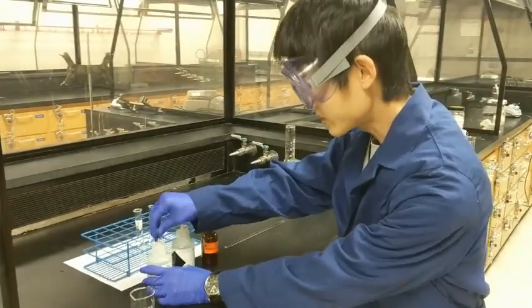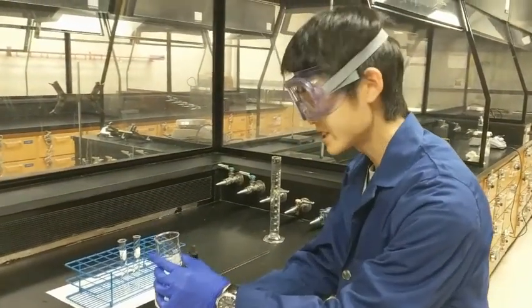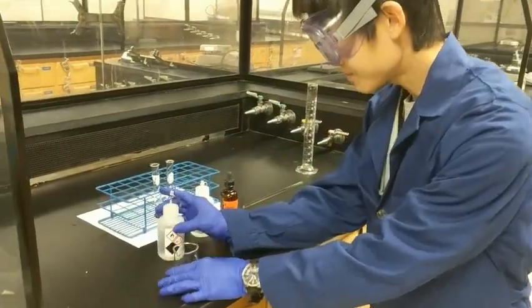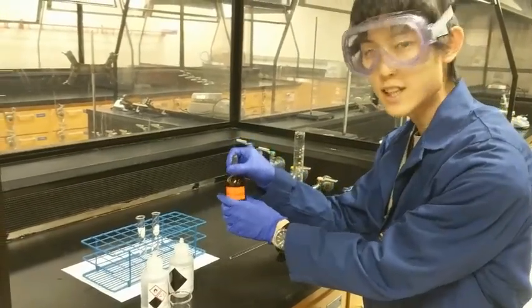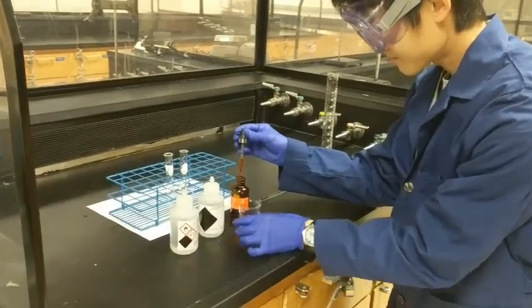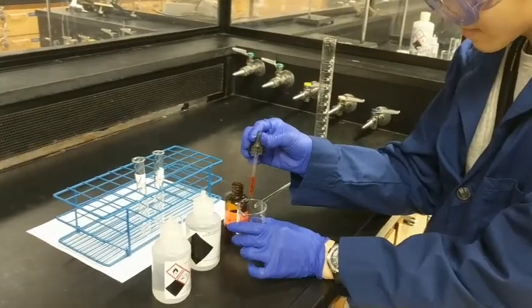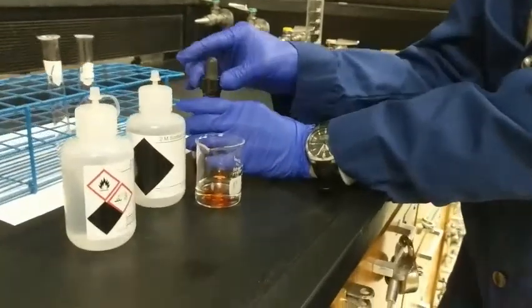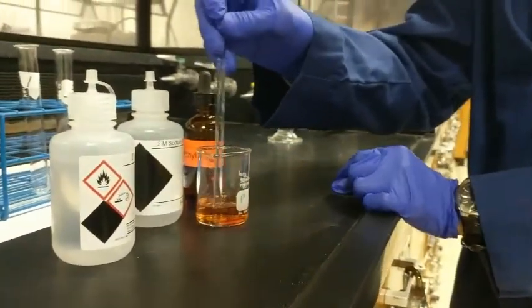And now we are going to put 2 drops of acetic acid into 15 milliliters of DI water. We are going to add 2 drops of methyl orange indicator. Now, just gently mix it together.